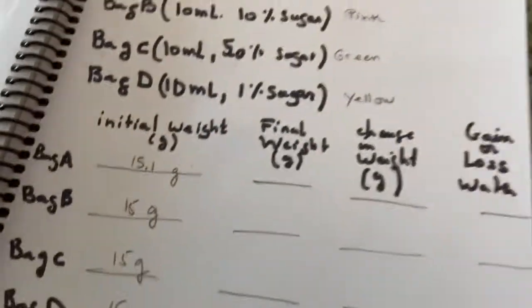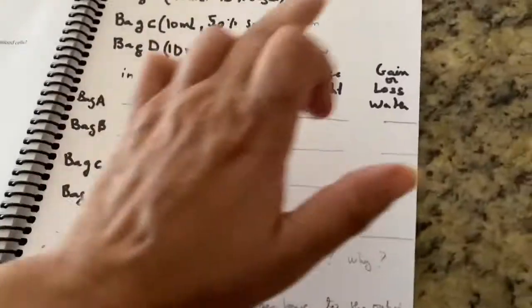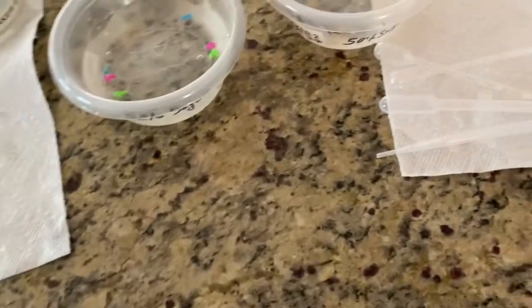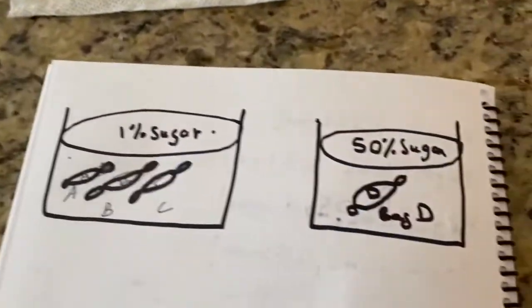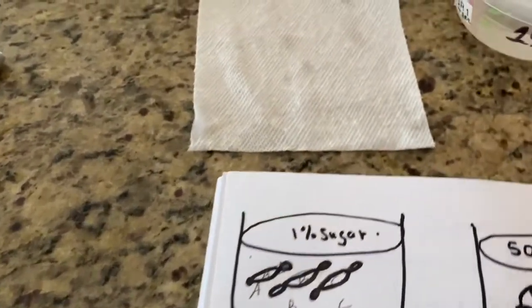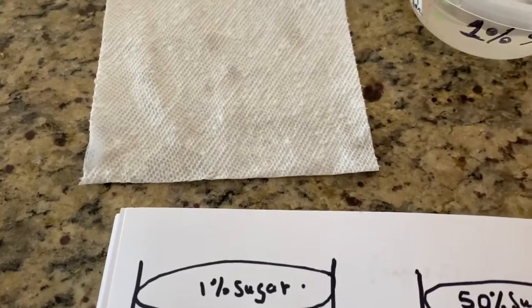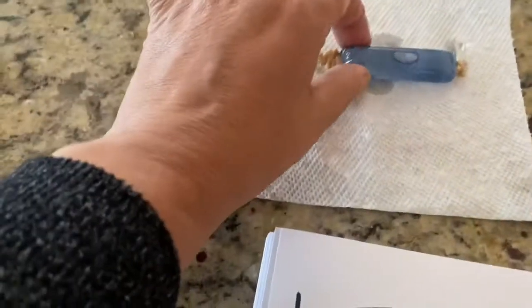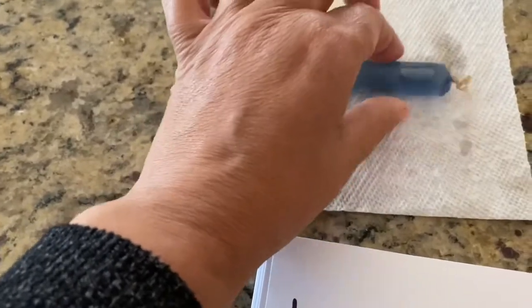And the bag D, which is the yellow, I have 1% in it, but we are going to put it in 50% of sugar. All right, and I will see you after 30 minutes. Wait again, 30 minutes, 40 minutes, and look at that, how beautiful it is. I love that. Look at our star solution.